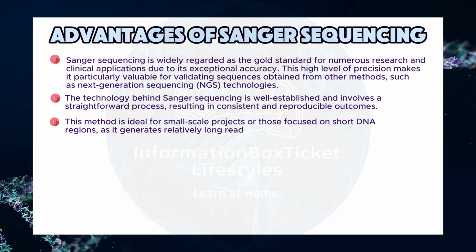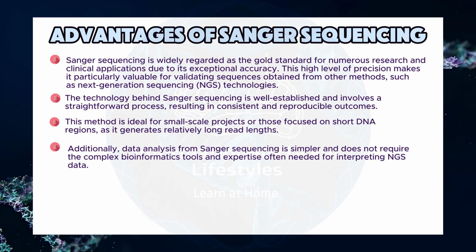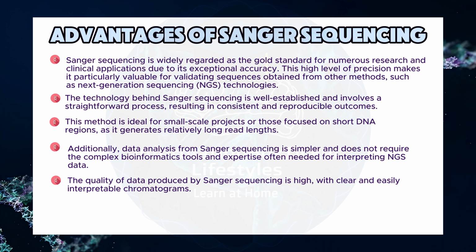outcomes. This method is ideal for small-scale projects or those focused on short DNA regions, as it generates relatively long read lengths. Additionally, data analysis from Sanger sequencing is simpler and does not require the complex bioinformatics tools and expertise often needed for interpreting NGS data. The quality of data produced by Sanger sequencing is high, with clear and easily interpretable chromatograms.